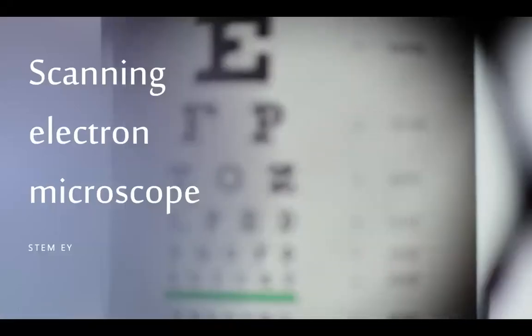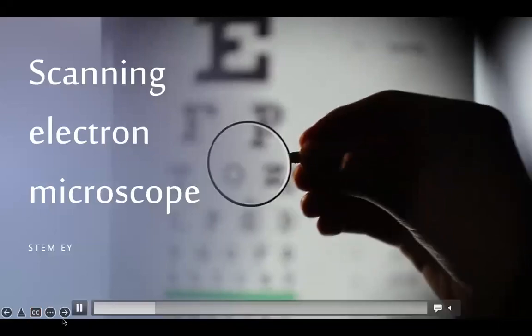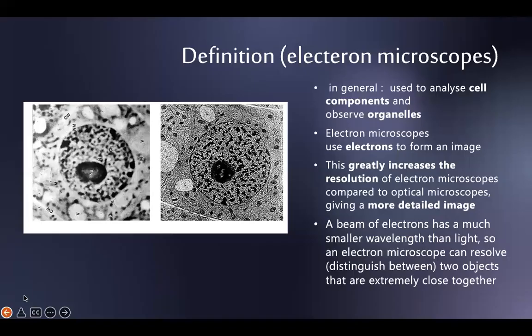Scanning electron microscopes. So, by definition, electron microscopes in general are used to analyze cell components and observe organelles. Electron microscopes, in specific, use electrons to form an image.